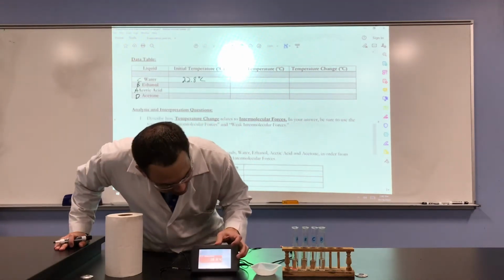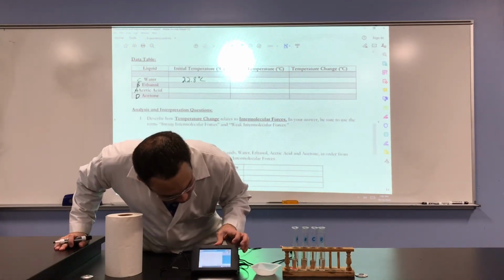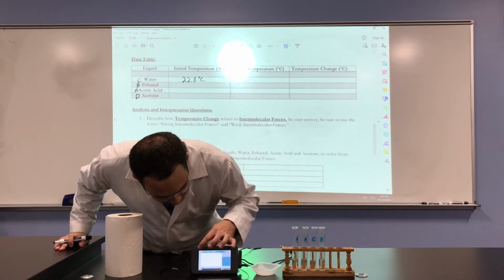So we're at 18.9 degrees Celsius, and we're 100 seconds in.